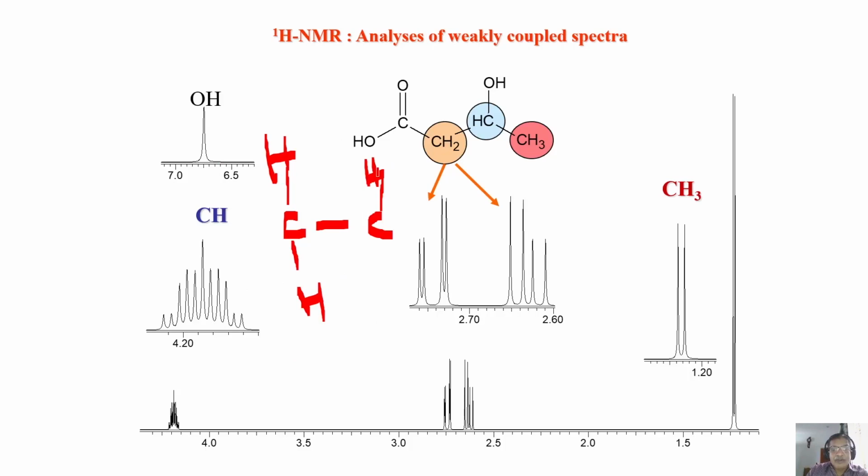One of these protons, in this configuration, is in a trans configuration with a large coupling. I agree. In addition to that, it experiences a geminal coupling. You understand?